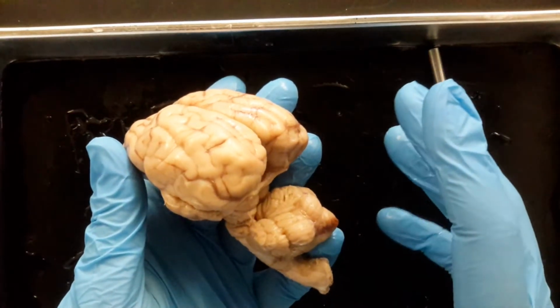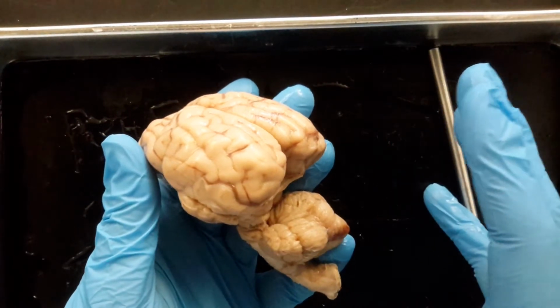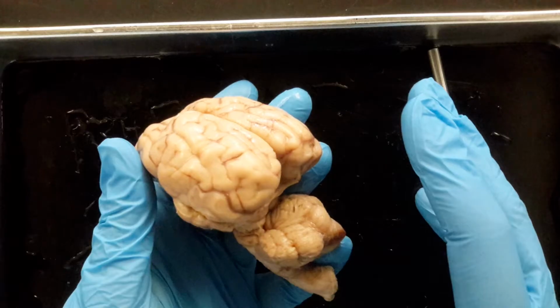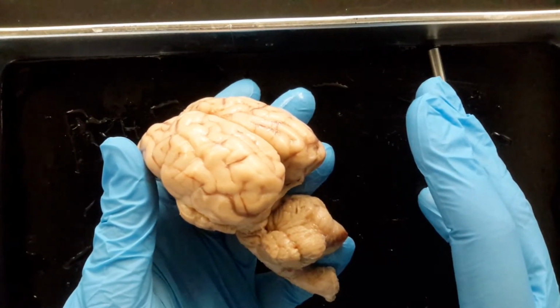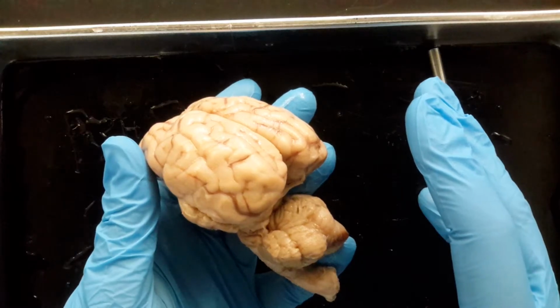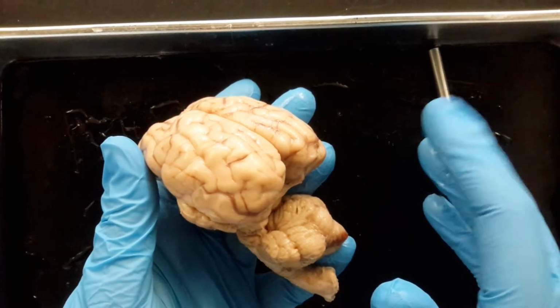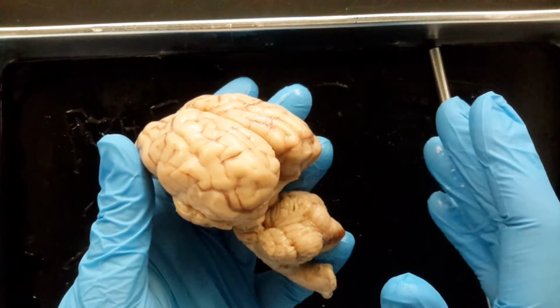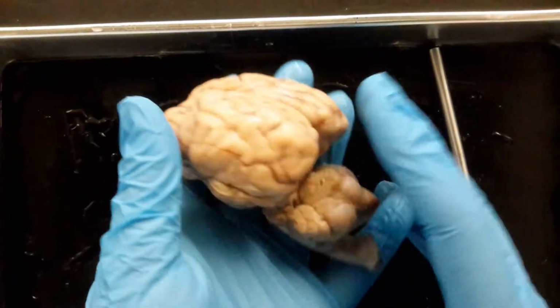And so if you had a whole brain on the quiz, you would need to know right versus left. If it's just a half brain, I am not going to ask you to say right versus left because that's really kind of unfair. Okay? So only right versus left if there's a whole brain on the quiz asking you to identify something. Otherwise you don't need to worry about it. Okay, so those are the major lobes.